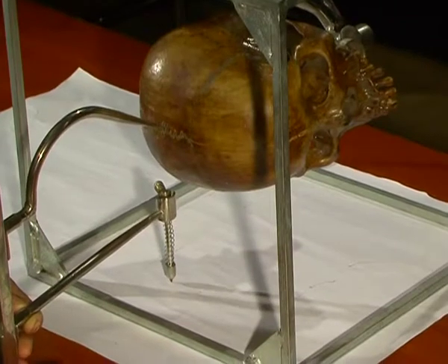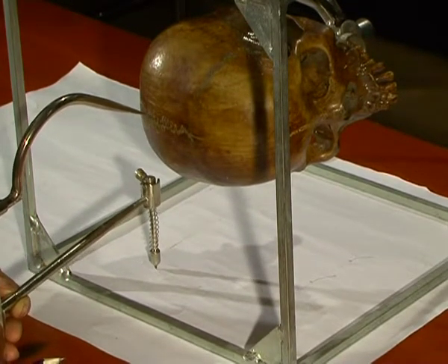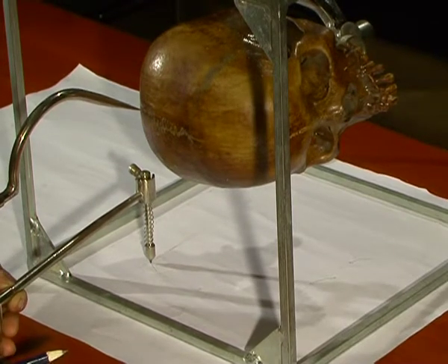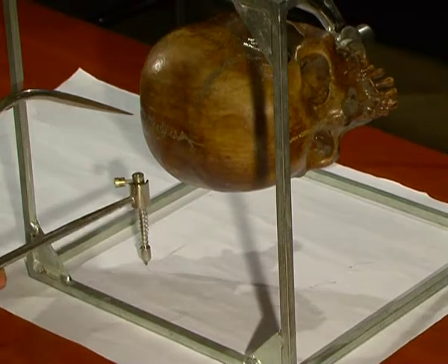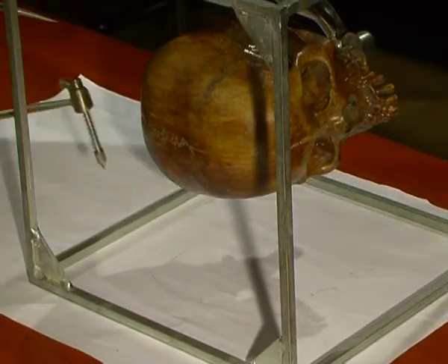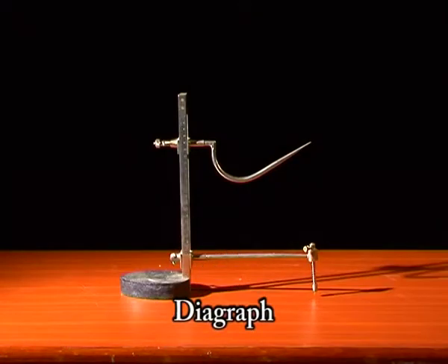Utility. The cubic craniophore is used in time of making sectional drawing of a skull. It is used for drawing craniograms by means of diagraph, as well as for drawing the normas and the dioptrographs or taking their photographs. The contour so drawn can be used for taking indirect angular measurements. Diagraph.